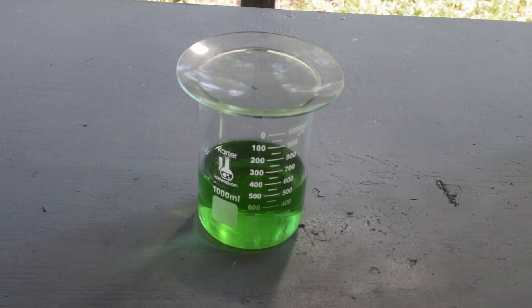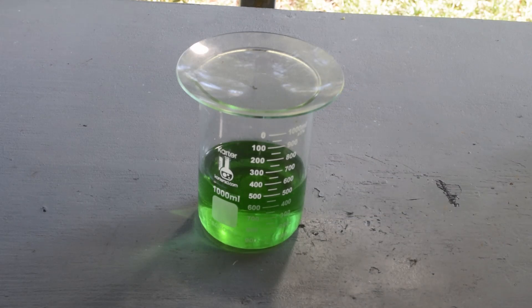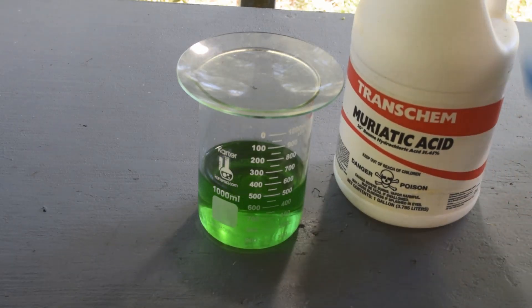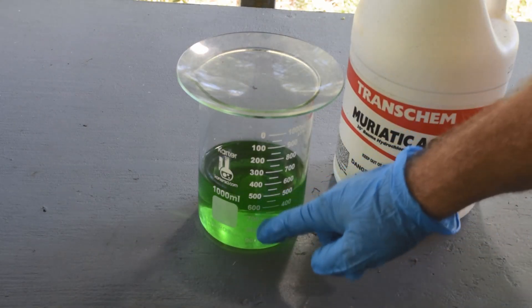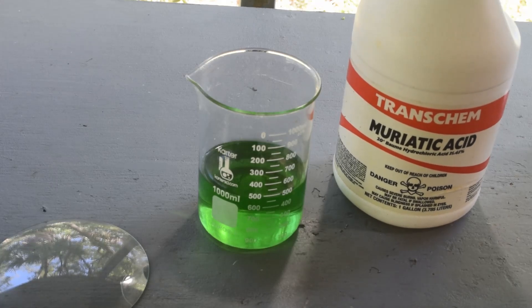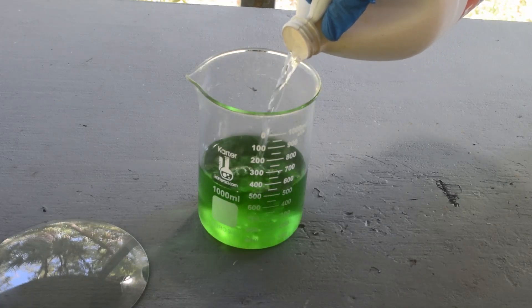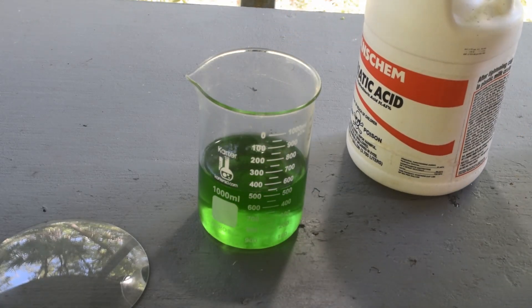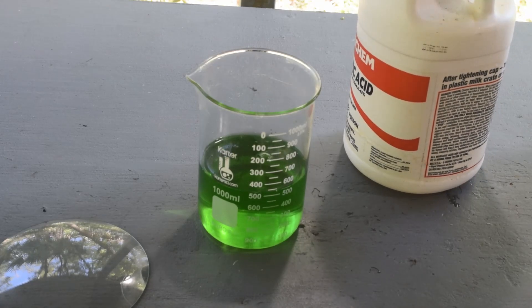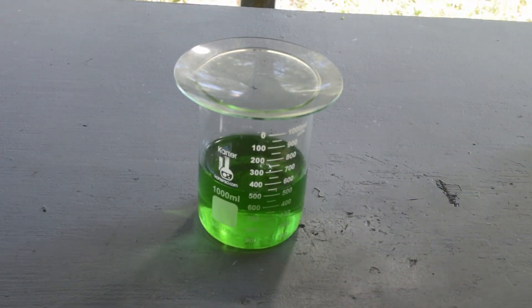The first thing I'm going to do — because I've learned a lesson from the last video — is re-acidify this stuff a bit. This was rehydrated with just distilled water, so there isn't any hydrochloric acid in here. I'm going to put in maybe 50 milliliters, just to make sure it's good and acidic again before we start adding zinc. That should help the reaction along and eliminate any excess zinc.